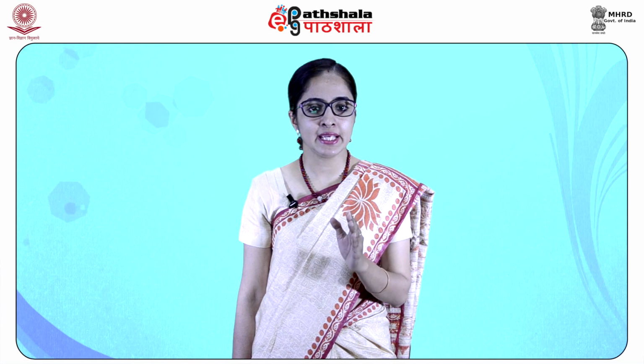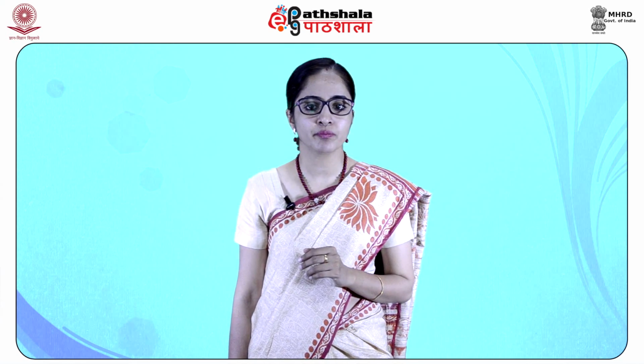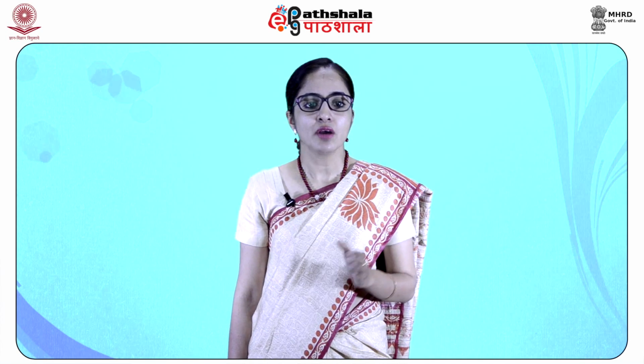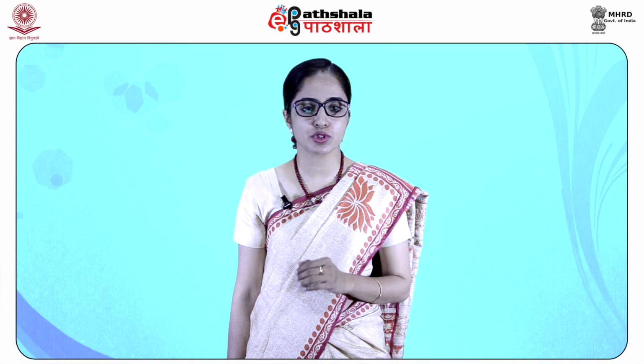Only complete orientational averaging allows us to observe narrow resonances. To get a 13C NMR, or carbon NMR, or DEPT NMR spectrum, a larger amount of sample is required, almost 10 to 50 milligrams, with a longer period of time for acquisition, that is 10 to 30 minutes, due to the reduced sensitivity of carbon-13 relative to the proton.